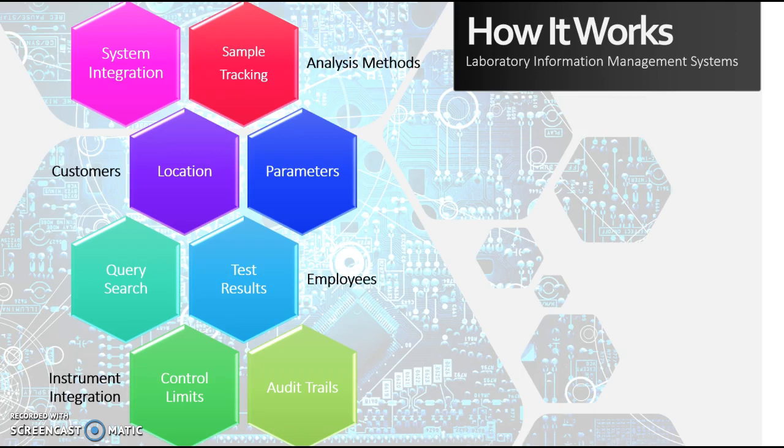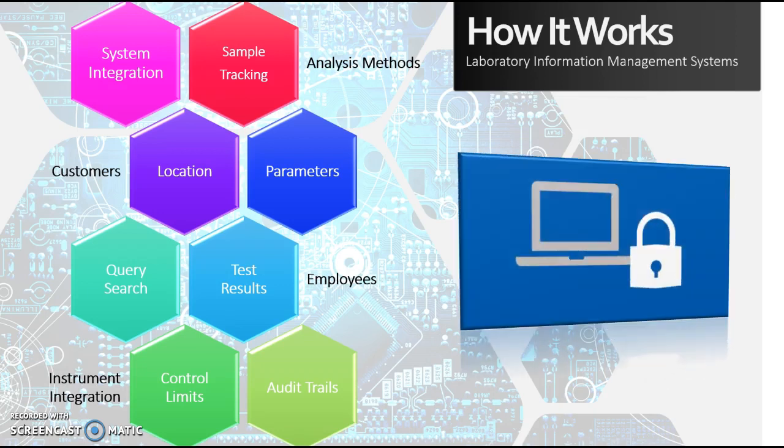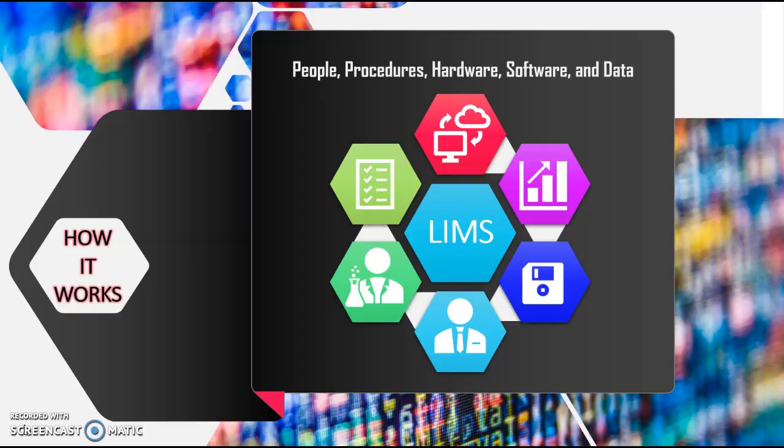The tracked consumables and resources are kept up to date digitally, so the required work is put into a process, such as preventative maintenance and calibration schedules. If the required maintenance and calibration is not completed, then the instruments of interest will lock out automatically until the required scheduled tasks are completed to ensure only high-quality results are being produced on maintained instruments.